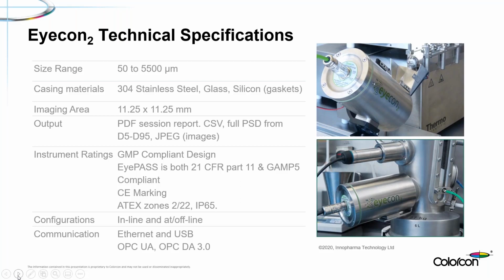Typically, at least in pharma processing, puts us well into that range, 100, 200, 300, 400, 500 microns, which is just the butter zone for the system, the ideal range to use it in. So while it may not work on your micronized APIs and your incoming raw material lactose, for example, once you start to granulate that, it's an excellent way of keeping track of your processes and your material performance at that point.